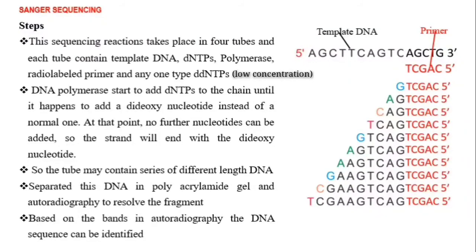Based on the bands in the autoradiography, we can construct the sequence. That means we can identify the sequence based on the bands in the autoradiography.